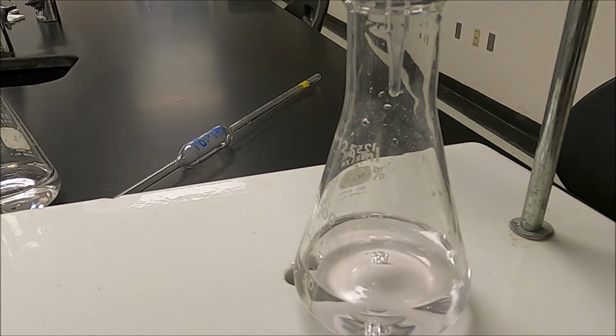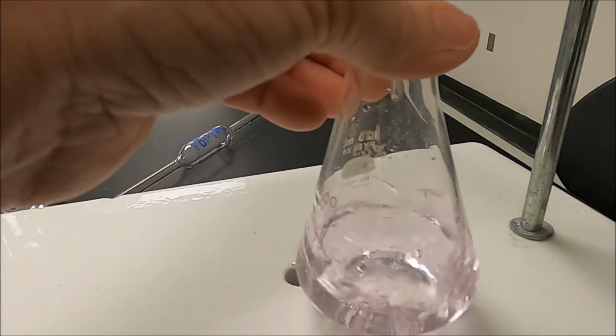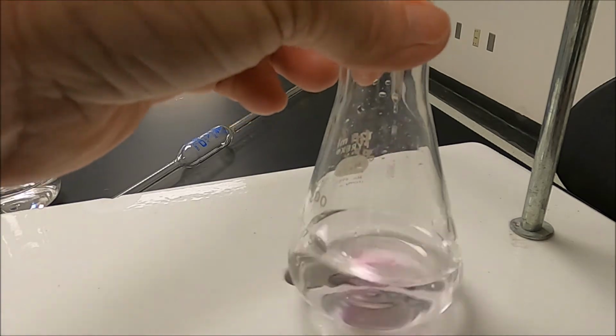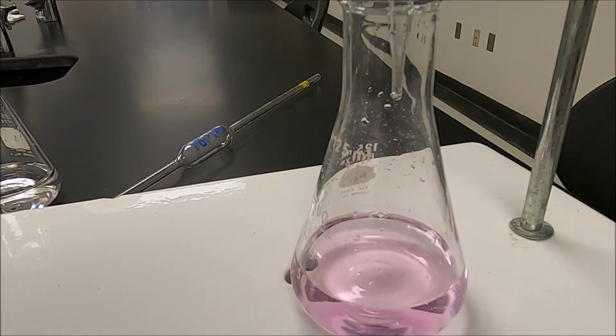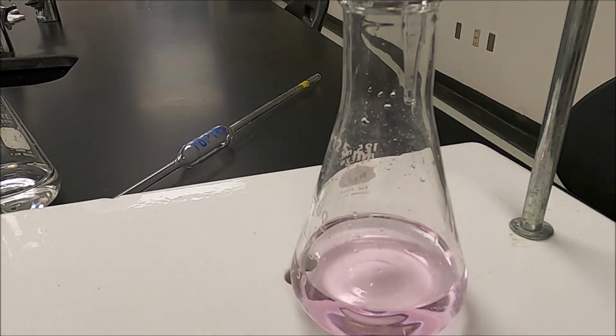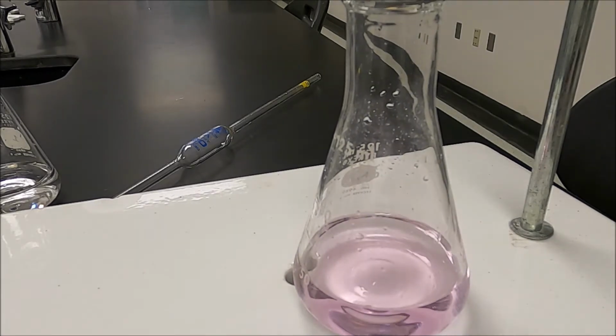Oh, okay, that's real close. Okay, couple of drops. There we go. And this time I'm getting a final reading of 44.00. Okay, now I'm going to have to refill the burette before I go on, because I have less than 10 milliliters left in the burette, and we know it's going to take 20 something milliliters to get to where we want to go.